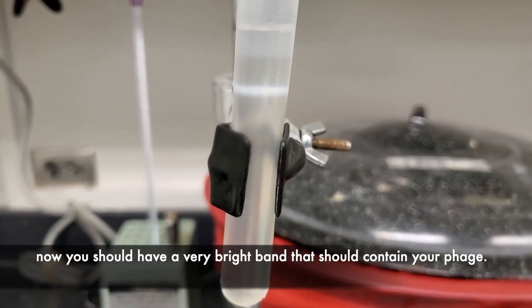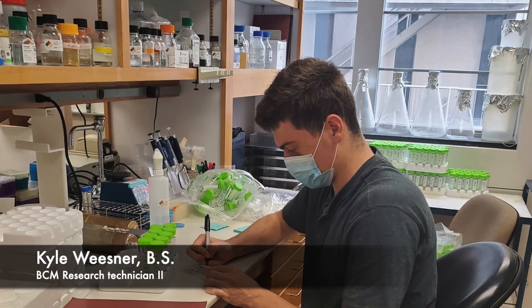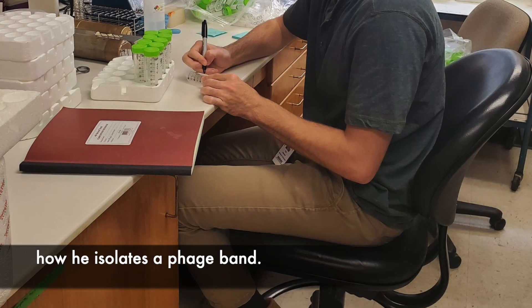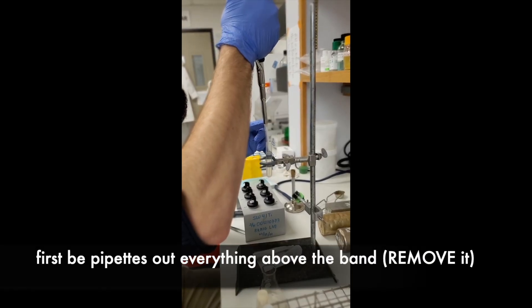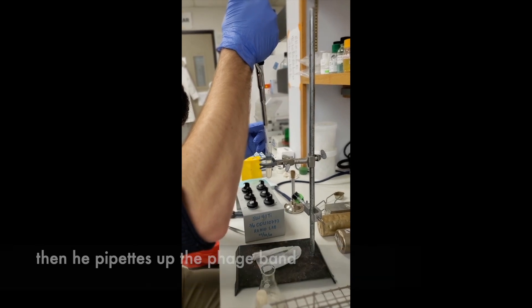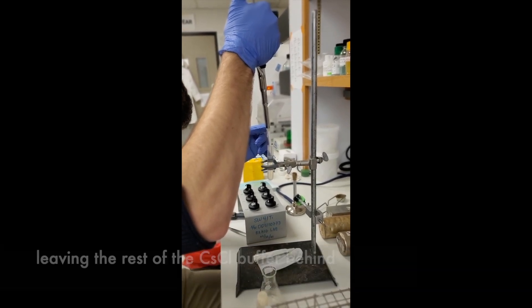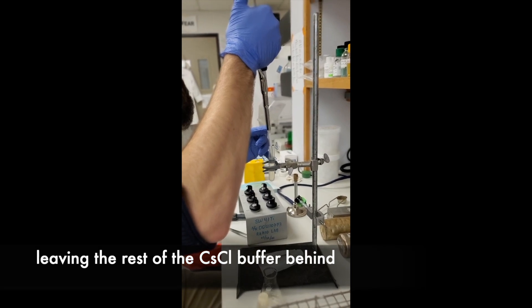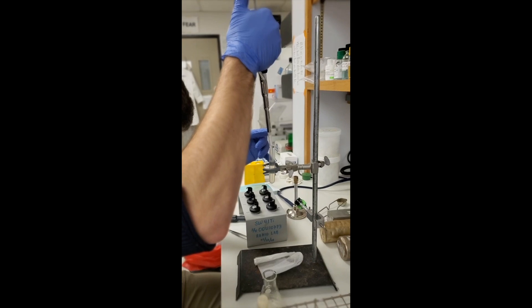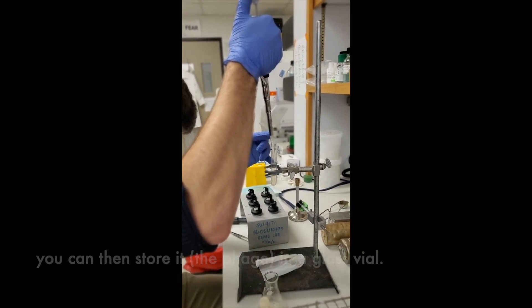Now you should have a very bright band that should contain your phage. Very talented technician Kyle Wiesner will show us how he isolates a phage band. First, he pipettes up everything above the band. Then he pipettes up the phage band, leaving the rest of the cesium chloride buffer behind so as not to dilute the phage. You can then store the phage in a glass vial.